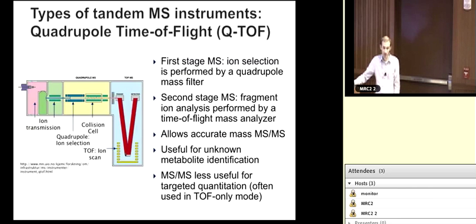But yeah, absolutely. I think a lot of the time the time-of-flight-based, untargeted-compatible analysis is the way to go for a first approach, and will give you just as good quantitative data as what you might get off a triple quad. Exceptions exist in all cases, but we do recommend that frequently.